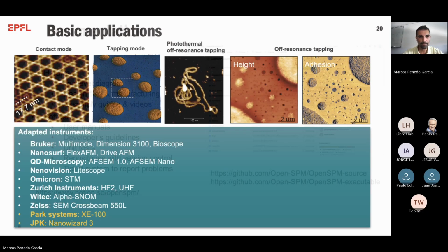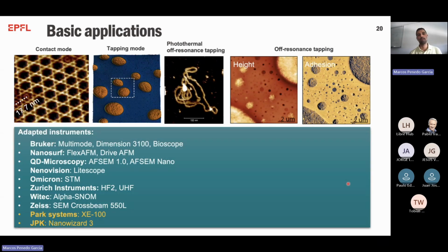And well, here's a brief summary of the different modes we have already installed. This is done with contact mode. Here you can see this structure or this pattern. You can see the resolution here. I mean, there's a periodicity of 17.7 nanometers.